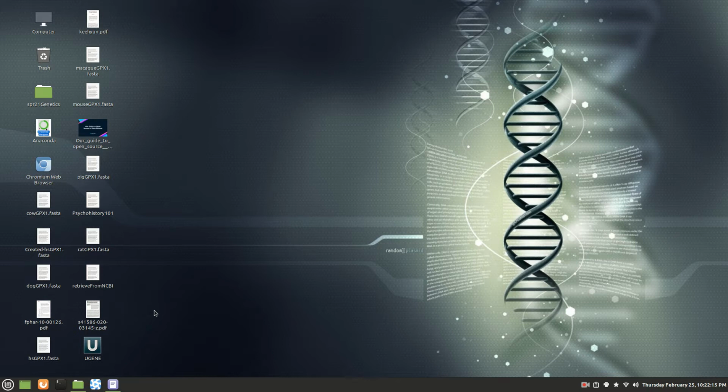The ones you want are these. These are what you're looking for. Look for the regions. These are some of those sequences. We want mouse, macaque or rhesus monkey, human, dog, and cow. So those would all be the ones you would be looking for in addition. What we just did was human, and your result you want to put into it as a FASTA.